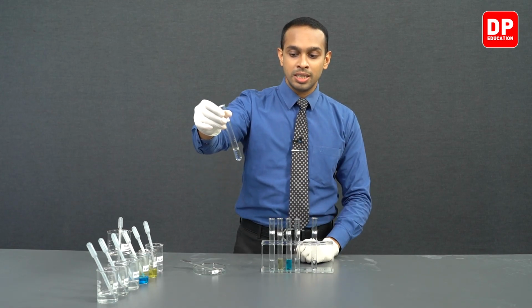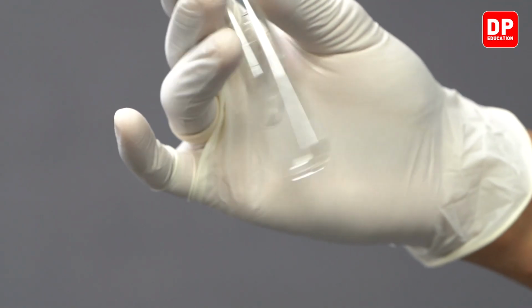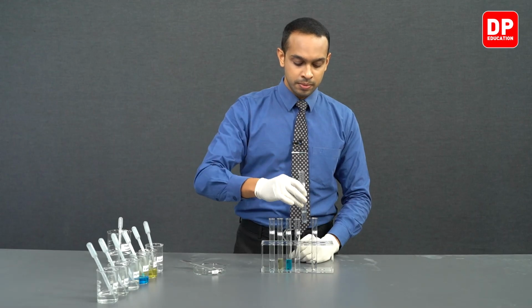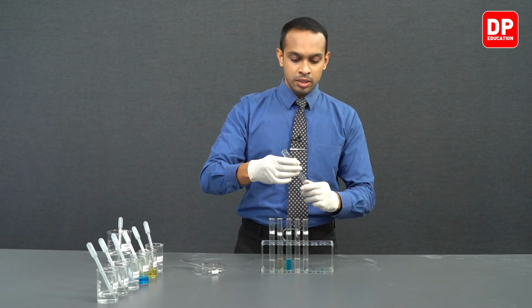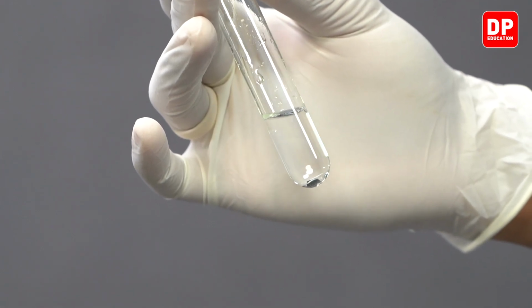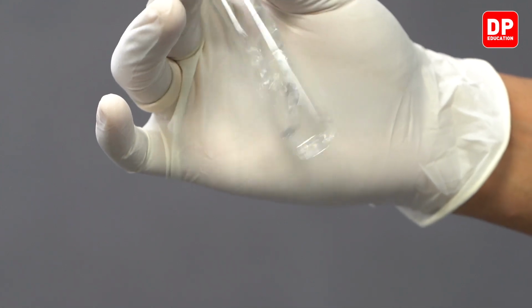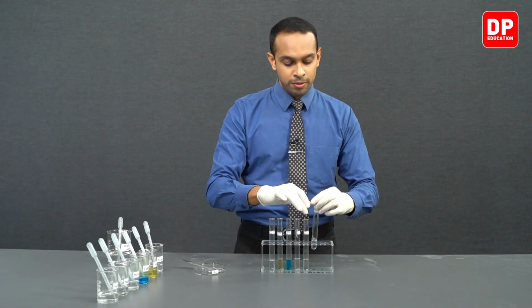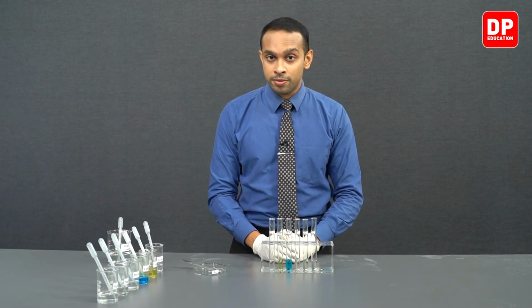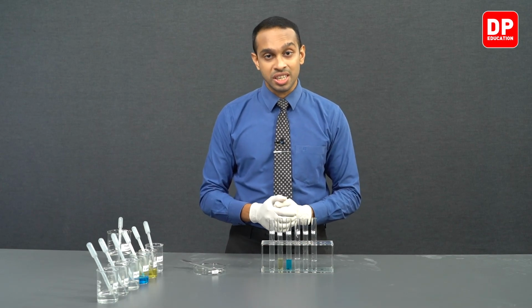But when it comes to magnesium 2+ and zinc, there is no reaction. Between magnesium and zinc, there is no reaction, students. And between sodium and zinc also, there is no reaction. Sodium 1+ ions and zinc metal, we don't see reaction straight away. So we will allow all of these reactions to take place for a while, and then we'll come back and observe what solutions have reacted and what solutions have not reacted with zinc metal.